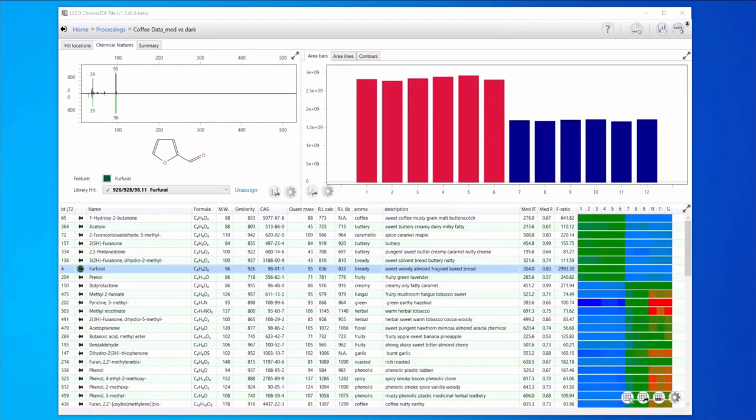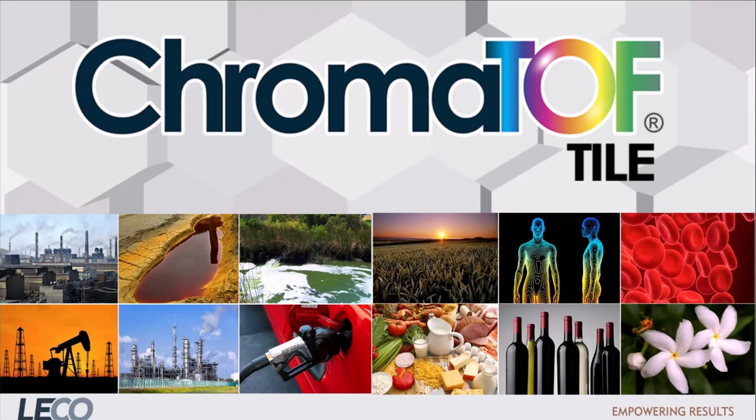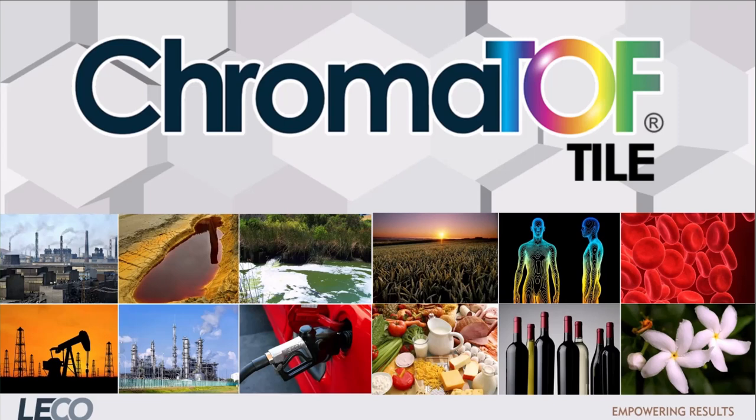ChromaTOF Tile is an efficient way to focus your analysis so that you can quickly find the important information in your data. In this example we explored coffee and roast level differences but this tool has broad applicability for many types of samples and experiments when the analysis goals involve comparing different classes or groups of samples with each other.